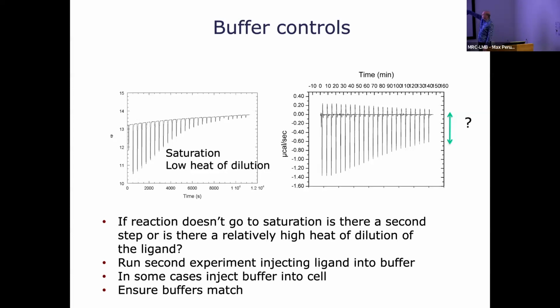On the right here, you get to the end and you go, well, I've still got quite substantial heats. Do I need to have different concentrations to go on? Or is there some kind of mismatch?